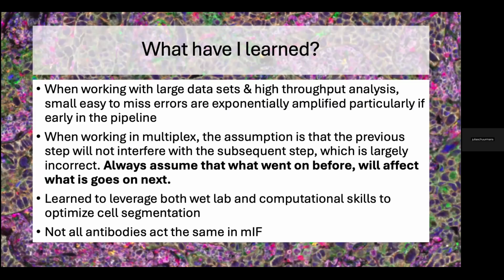Also, in addition, when working in multiplex, the assumption I had when I started in the lab was that when you put all 9 markers together, it should just work. There really shouldn't be anything else going on, but that was not the case. And nor will it be, because anything that goes on before will affect what goes on next. And that was a big learning for me.